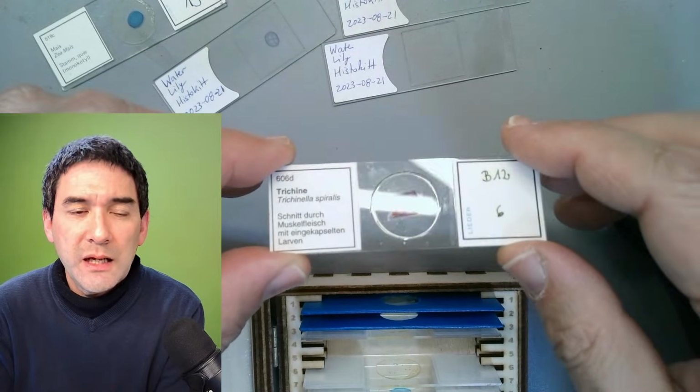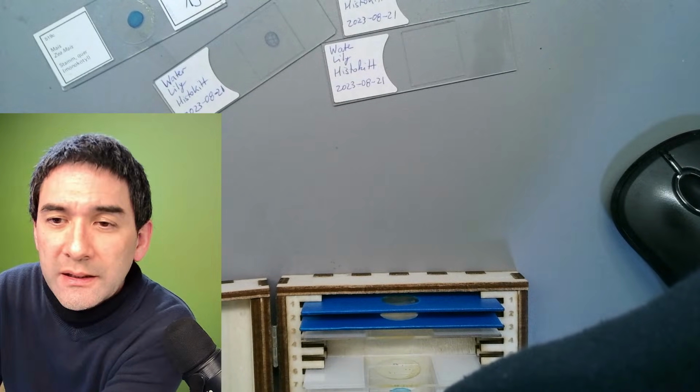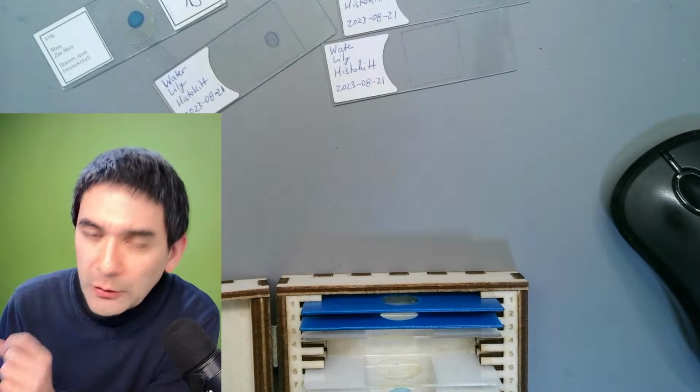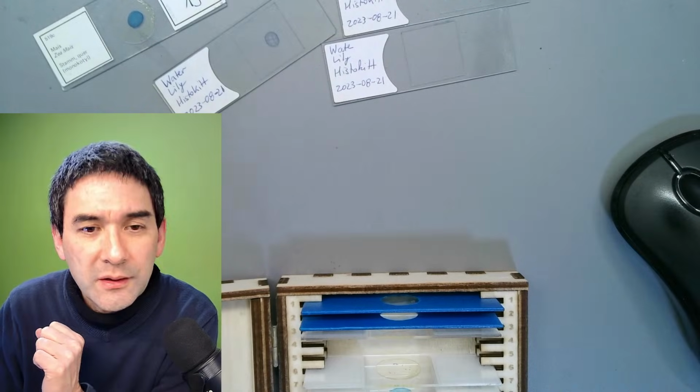Okay, you can actually see something quite interesting. I'm reading a little bit. If I'm interrupting myself, then I'm reading. You can get those close to dark field with Olympus. I need to adjust, and maybe also the lower one. There are different ways how I can do that.